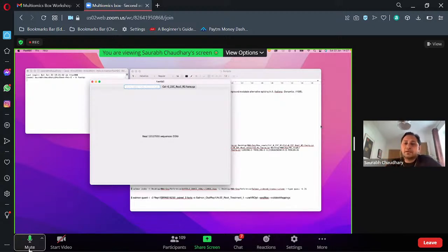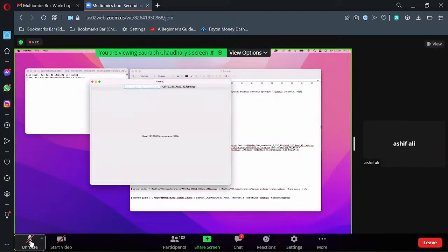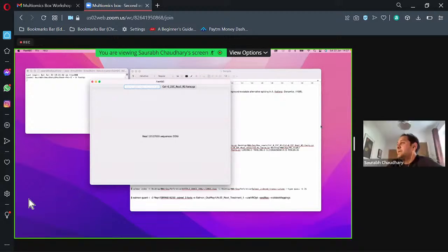It will run on Galaxy, and once it finishes, it will give you an email. You have to put your email address so you know your analysis is completed. Actually, on Galaxy at any time there are a lot of queries and job submissions going on, that's why they take too much time.